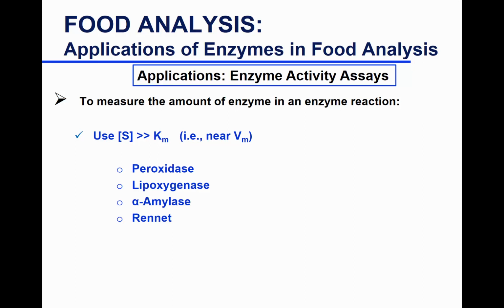They measure something called falling number. Have you heard of this term? Falling number? You did not come across anybody? No? So a quick method to determine the starch and the amylase activity in your flour. So you will put flour and water in certain proportion in a kind of graduated cylinder, and then you have a plunger, and then you monitor how fast your plunger moves a certain distance in your graduated cylinder. That gives you an indication of the viscosity of your starch in the flour.